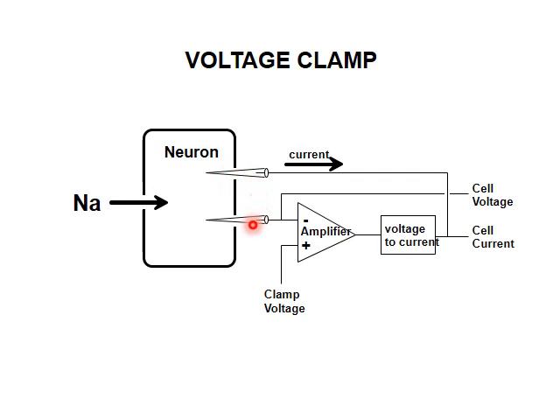What is illustrated here are classical sharp electrodes that are inserted into the cell, but the voltage clamp technique can also use patch electrodes, whole cell patch electrodes, to measure voltage and inject current, or there is a variant of the technique where a single whole cell patch electrode can be used to voltage clamp a cell as well.